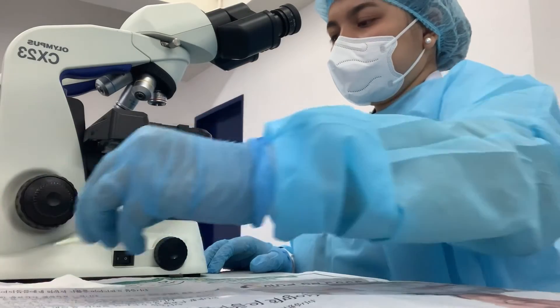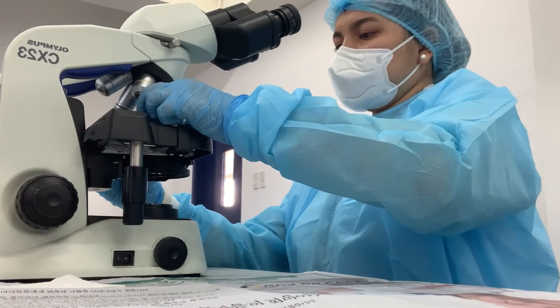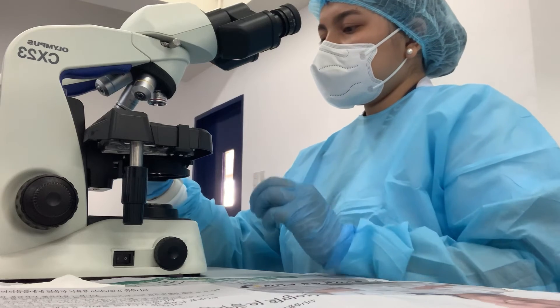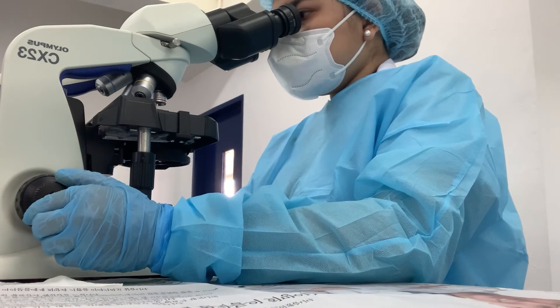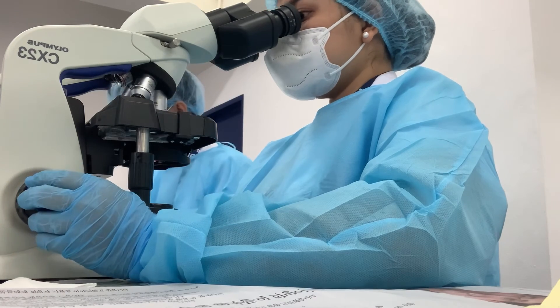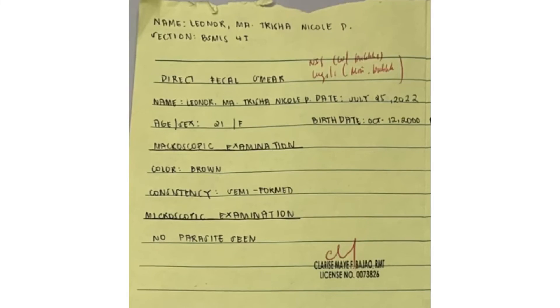Put the slide under the microscope and examine both smears. Record if there are presence of parasites. Record your findings.